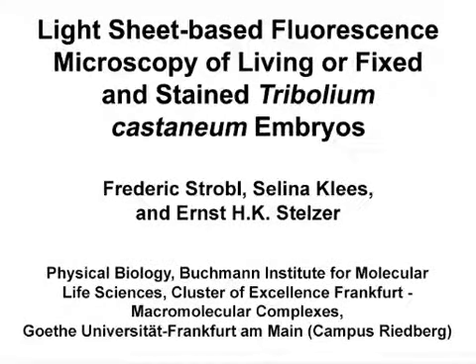The overall goal of this protocol is to observe the development of Tribolium castaneum embryos non-invasively over very long periods of time.